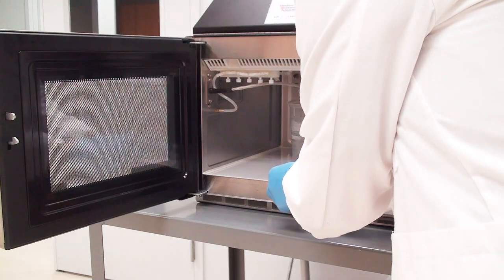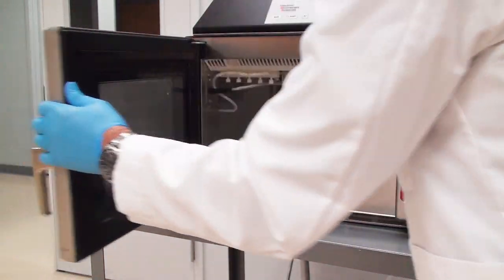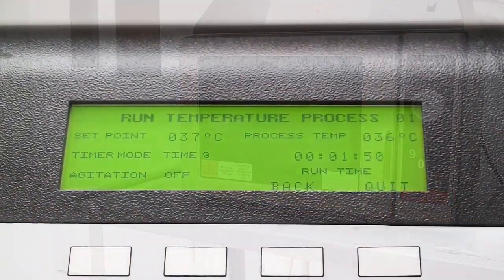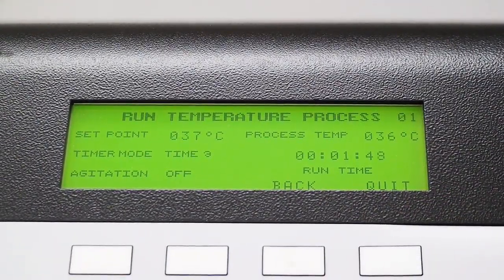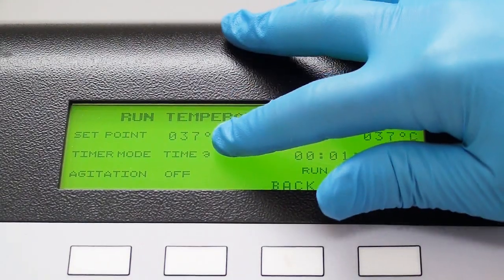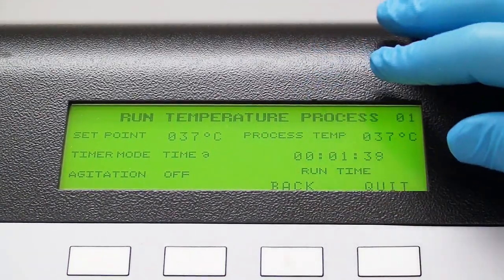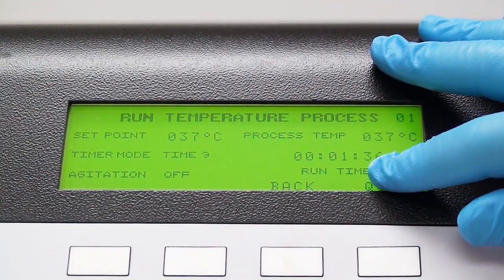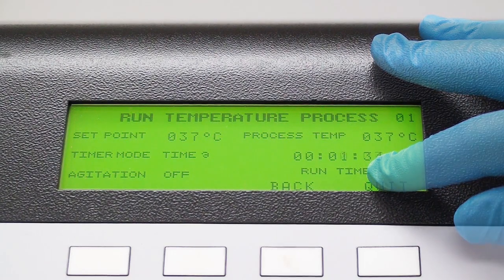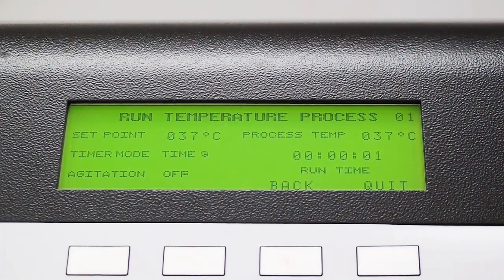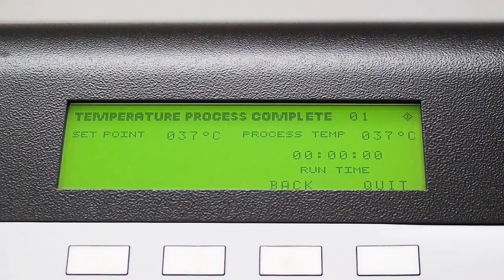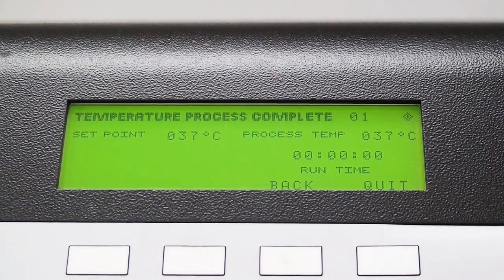We'll put this in the microwave, and I have my time set. I'm going to do it for 37 degrees, and I'm doing it for 2 minutes. I've already started, obviously, and I'm running 85% power. So that should work out very well. Our time is up and we're going to take those out.